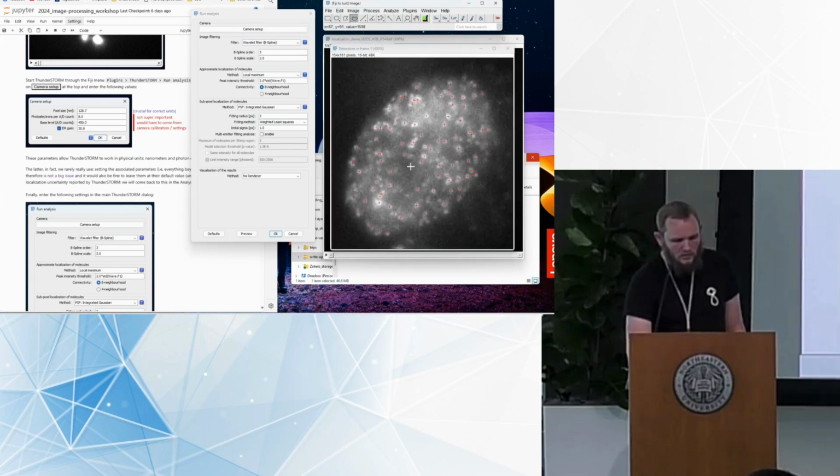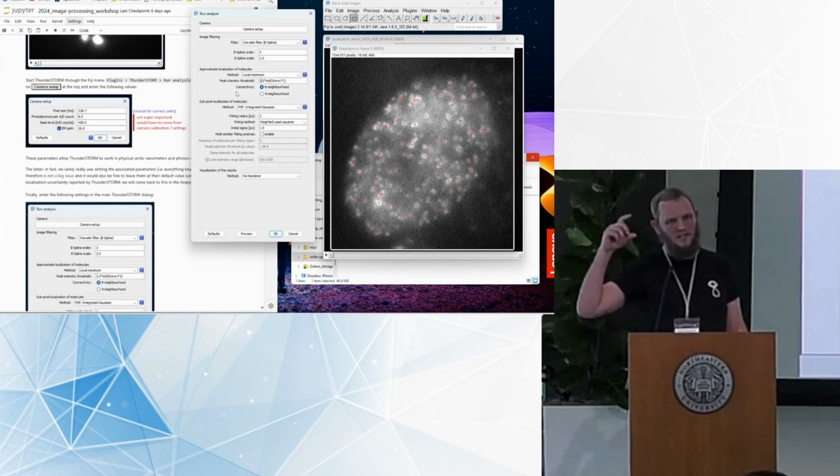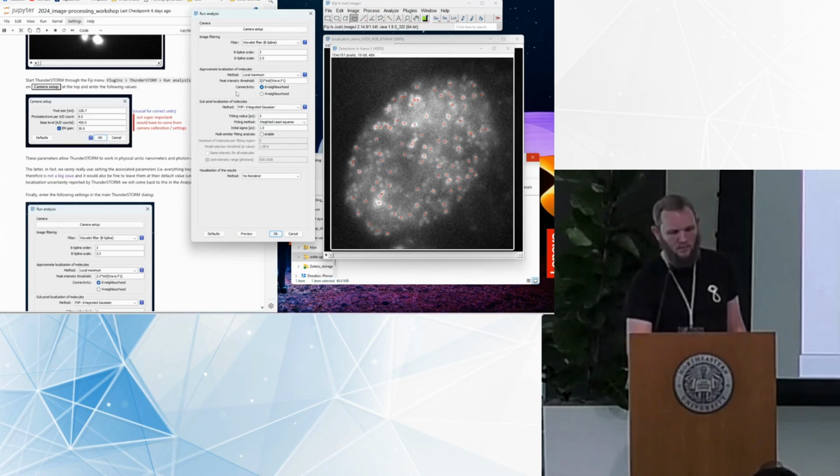The one thing I want you to do is to play with this maximum finding here. You can see that right now the parameters are set reasonably well. What you can do is play with the prefactor in this threshold here, which controls how prominent a maximum has to be to be called a particle.